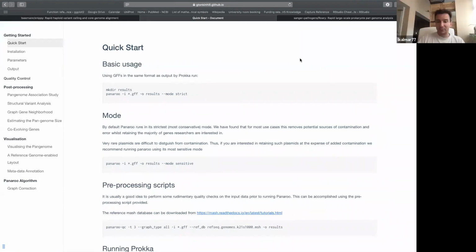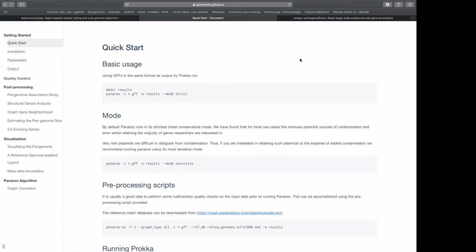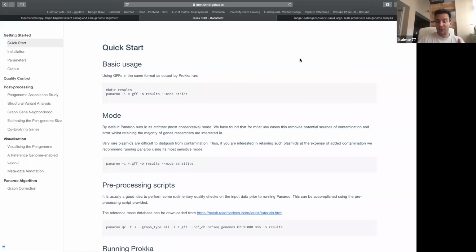Okay, so probably there is some problem when you are putting in 600. Okay, yeah, we will check that. But as soon as you're going up, it will be much more time consuming. According to the Panaroo paper, this is also one of the advantages of Panaroo, that it's much faster. So I think we will have a discussion with Chioma after today's meeting. So probably I will be able to tell you a bit more about our experience with Panaroo on Thursday.